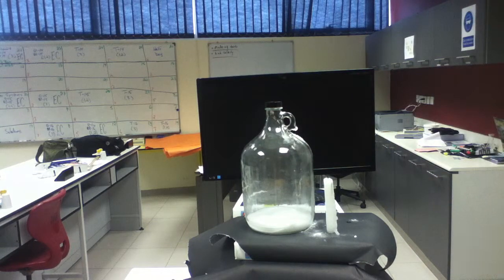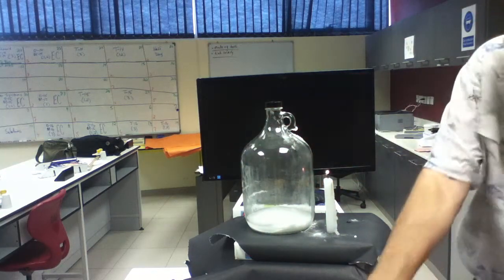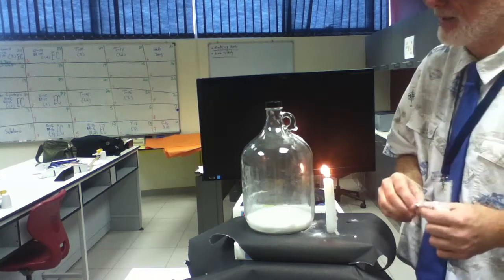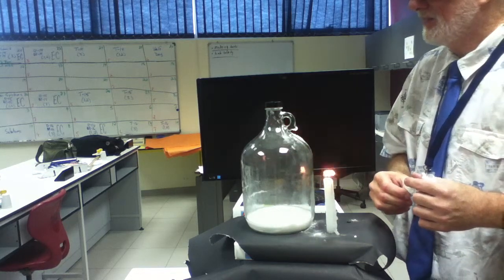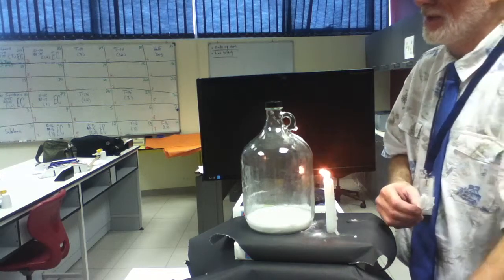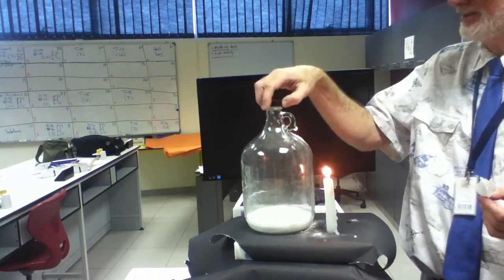All right, now, we'll do this. Again, we'll try the piece of paper trick. Notice I'm not using a large piece of paper because I'm so used to experiments not working. If you think I know a lot about chemistry, the amount I know about chemistry is directly proportional to the number of failed experiments I've done. The more failure you have in chemistry, the more you learn it. Isn't that weird?